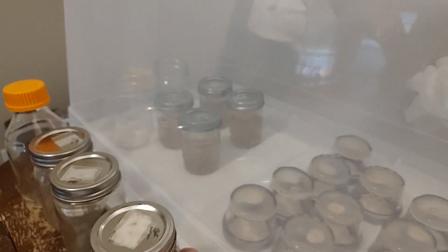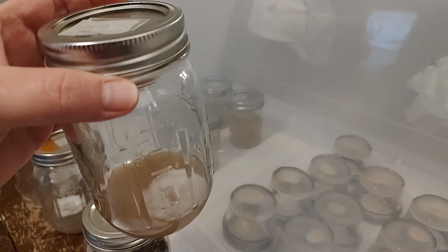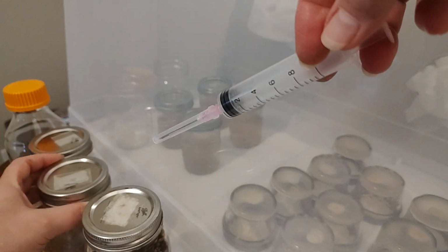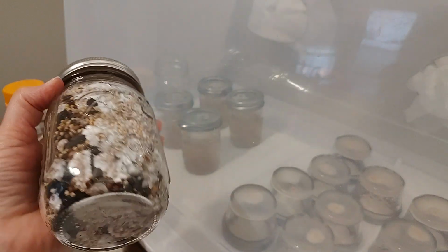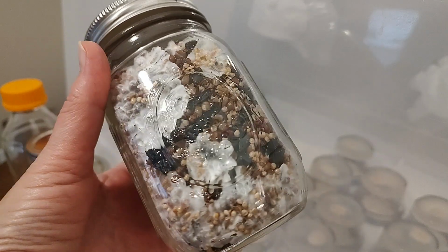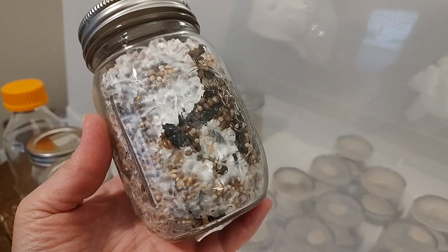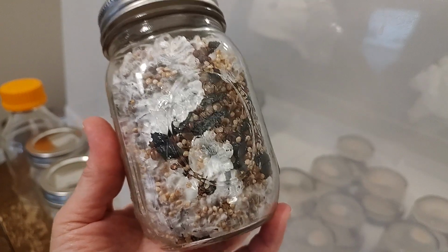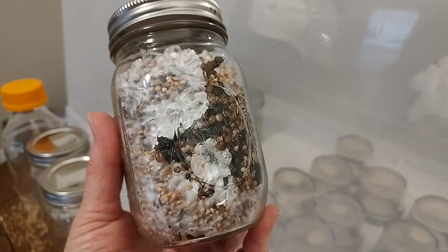And for us, it makes it really easy because what happens is you have all these liquid mycelium, liquid cultures, slurries, whatever it is. And then again, when you're ready to grow, you just pop your syringe in, pull out your liquid mycelium, put it right into your grain, your WBS, and you immediately start colonizing. And not only start colonizing, you're colonizing what you really want. And when you're more advanced and you get really good at it, then you can start cloning your own mushrooms. So whatever mushrooms you feel like are your prized mushrooms or the bounty, the harvest, maybe the tastiest ones, the most beneficial ones, you clone those and you can replicate that and grow the very best of everything.